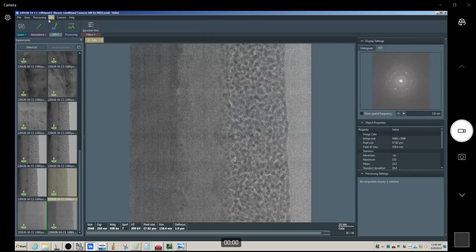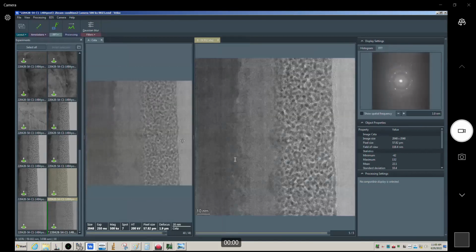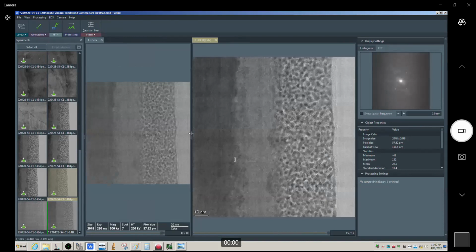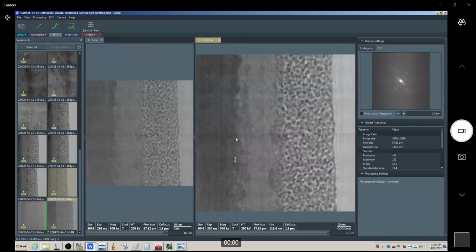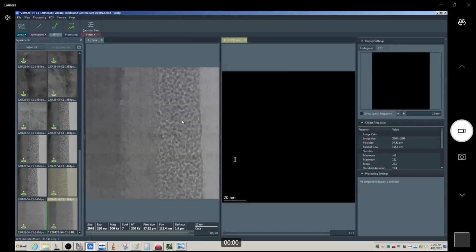All right. Let's see what we get now. Yeah, I can already tell it's looking a lot better. And over a quarter of a second, that should be quick enough that you're really not going to see much of an effect. You can see it kind of fouled up there. What happened? Let me try that again. Maybe it was something I did.